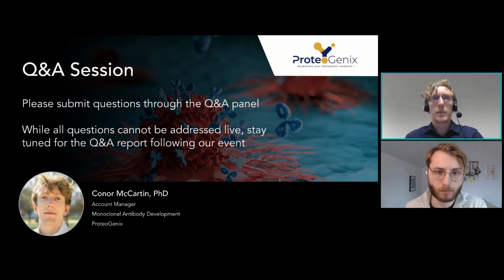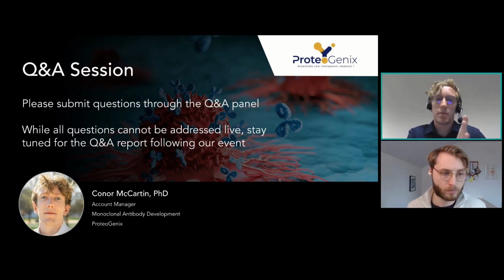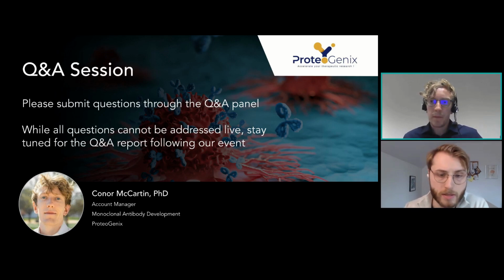But say if you have a project where you have two very similar proteins and you want your antibody to bind one and not the other, then we can take that negative protein and do depletions of the library so that we're only enriching for antibodies that are positive against the unique part of your protein that will render the antibodies you get out target specific. Right, makes sense.